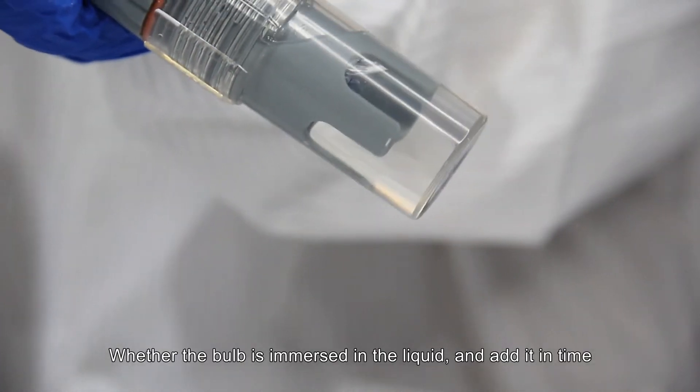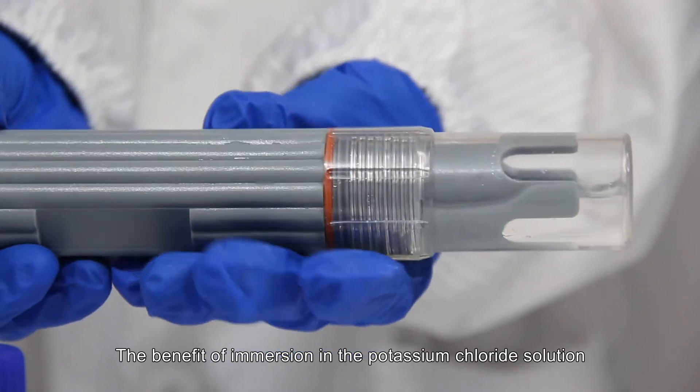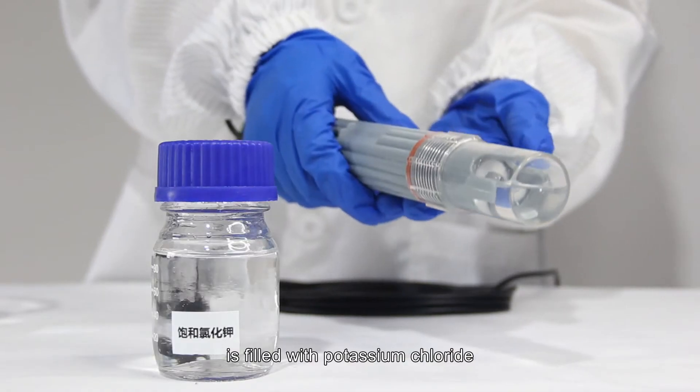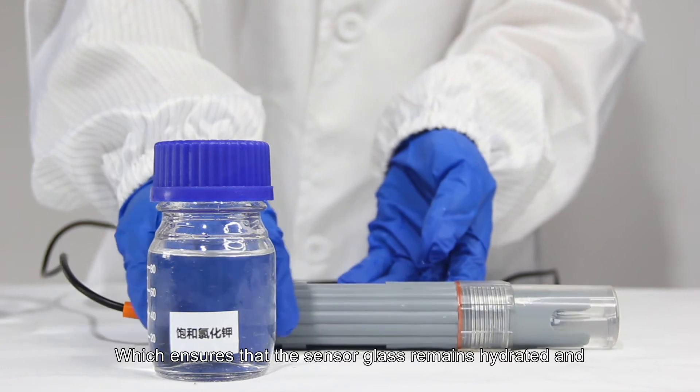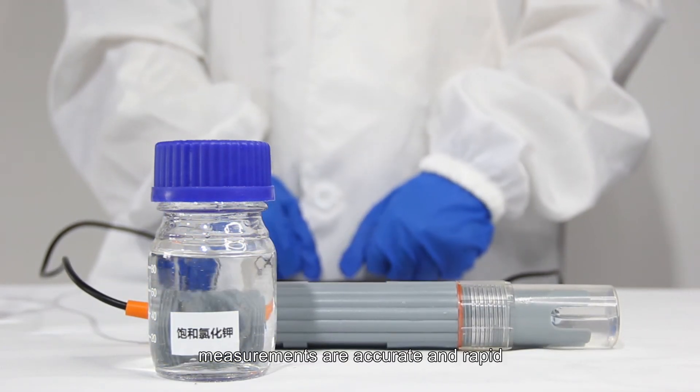The benefit of immersion in the potassium chloride solution is that the reference salt bridge is filled with potassium chloride, which ensures that the sensor glass remains hydrated and measurements are accurate and rapid.